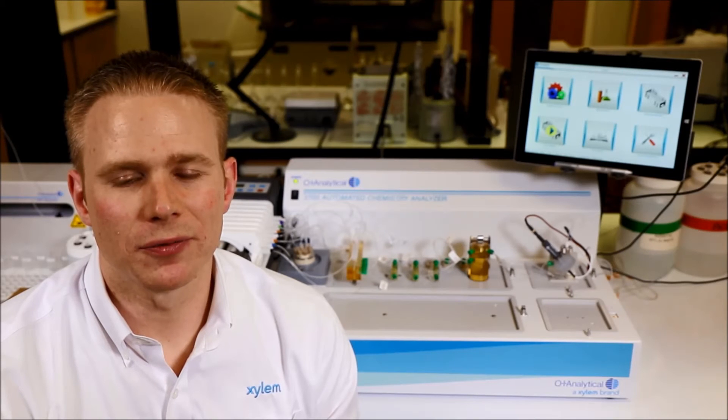In addition to our methods for cyanide analysis, we also offer methods for ammonia, TKN, phenol, anionic surfactants, total phosphorus, total nitrogen, chloride, and all of these by ASTM, ISO, EPA, or standard methods.